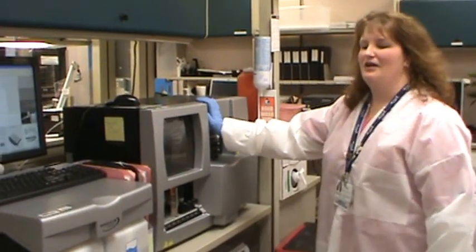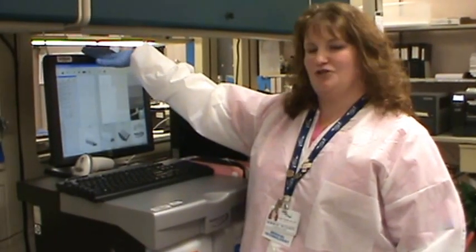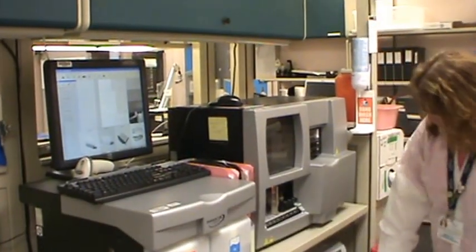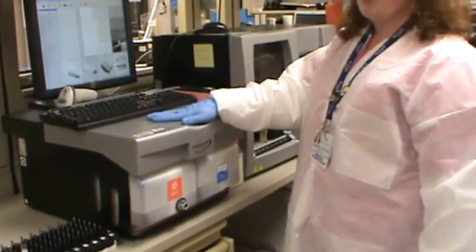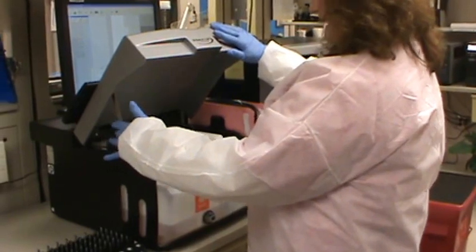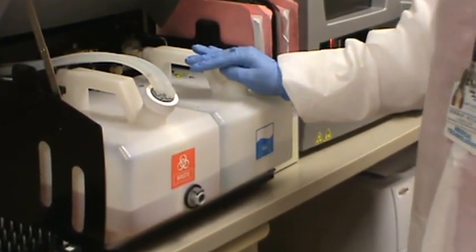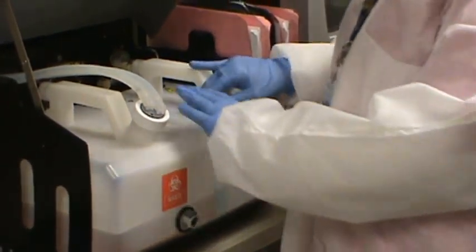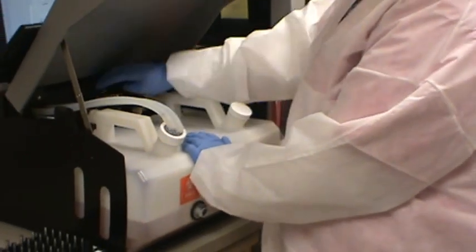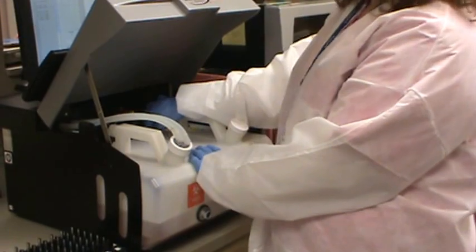There are several important components of the Echo. You have your PC, which includes your monitor, as well as your CPU and your printer. This is your fluidics module. Your fluidics module houses your waste container and your system liquids container. Your system liquid is phosphate buffered saline. Also inside your fluidics module is your 100 microliter syringe, your 1 ml syringe, and a peristaltic pump.